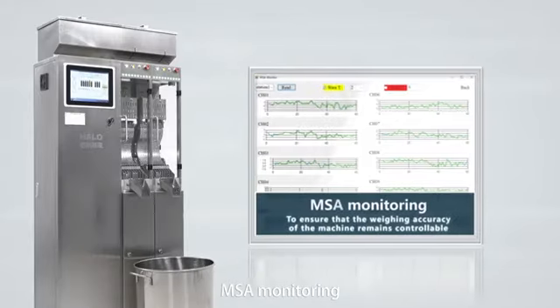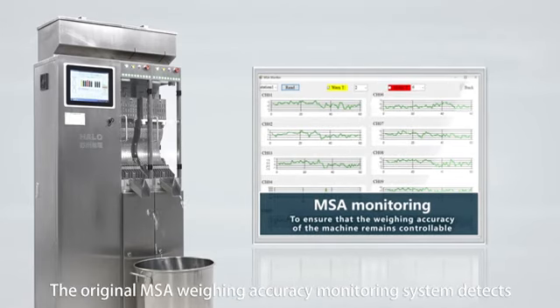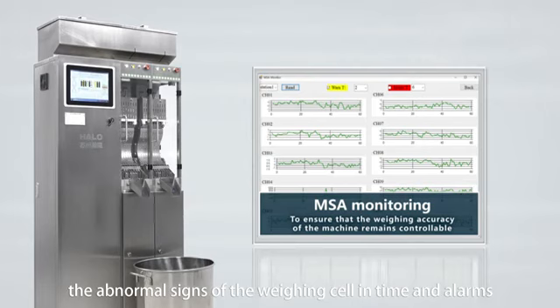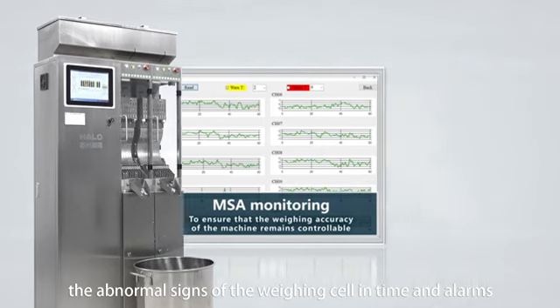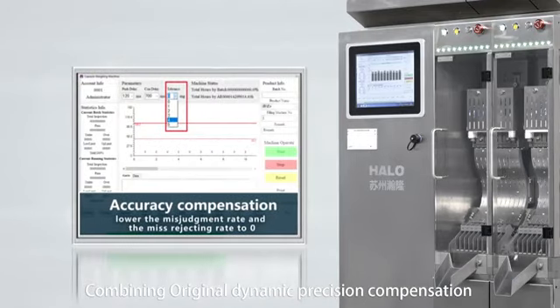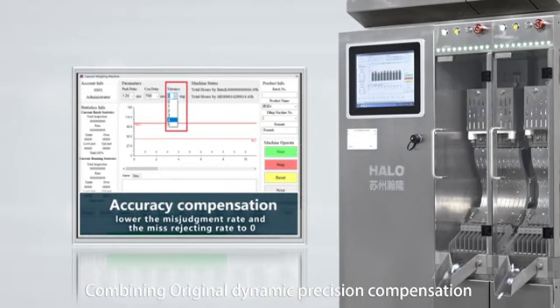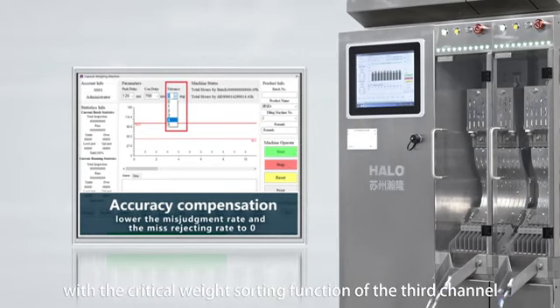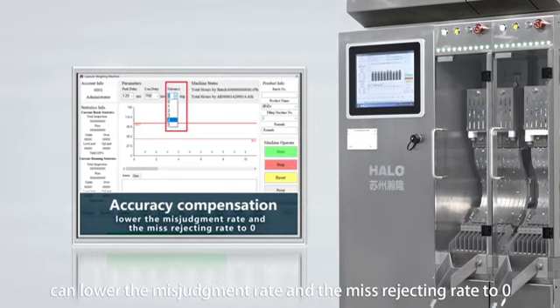MSA Monitoring. The original MSA weighing accuracy monitoring system detects the abnormal signs of the weighing cell in time and logs. Accuracy Compensation. Combining original dynamic precision compensation with the critical weight sorting function of the third channel can lower the misjudgment rate and the mis-rejecting rate to 0%.